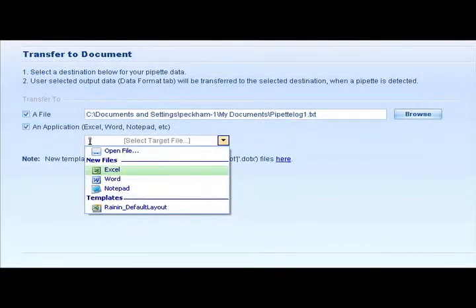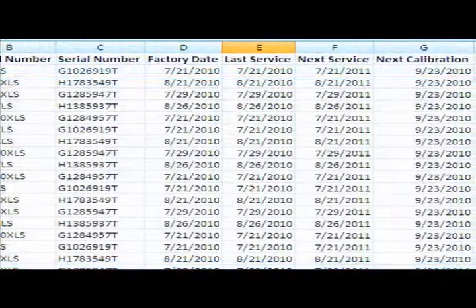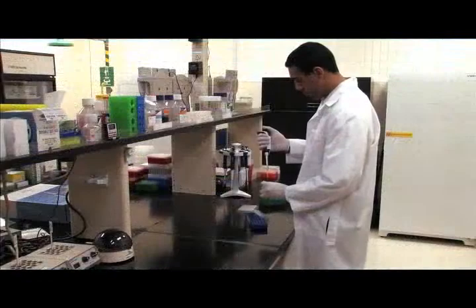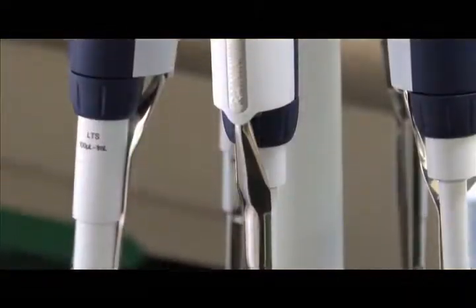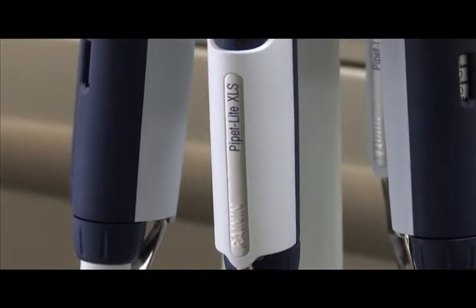Export your LabX Pipette data to Microsoft Word and Excel or save it as a text file to integrate it with a third-party asset management or calibration management program. Precision, accuracy, innovation. Raynin's new Pipette Lite XLS with RFID has it all.